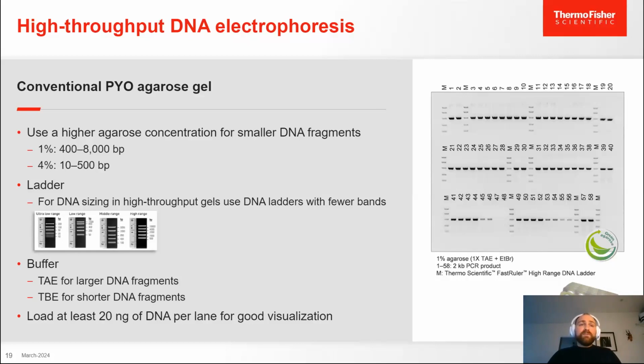Again, for buffers, same considerations, and for DNA fragment amounts, that still depends on how you're going to stain it, and on how much you have, but generally the guideline is about 20 nanograms of DNA, because the stains usually have a sensitivity of up to 1 nanogram, so you will have significant intensity from each of your fragments to perform this run.